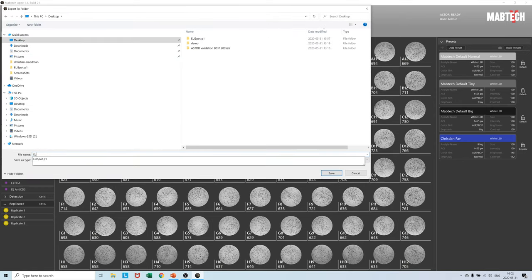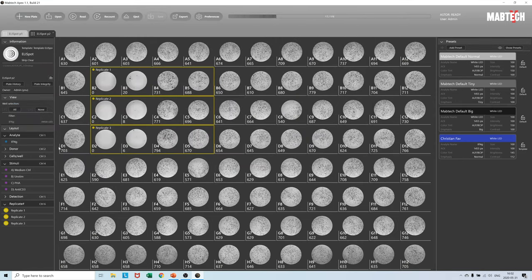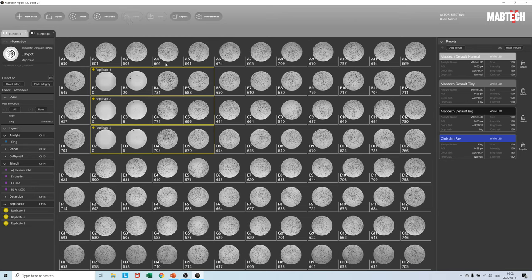As an alternative to the template function we can also use save as in order to carry over the layout and preset data to a new plate we want to analyze.